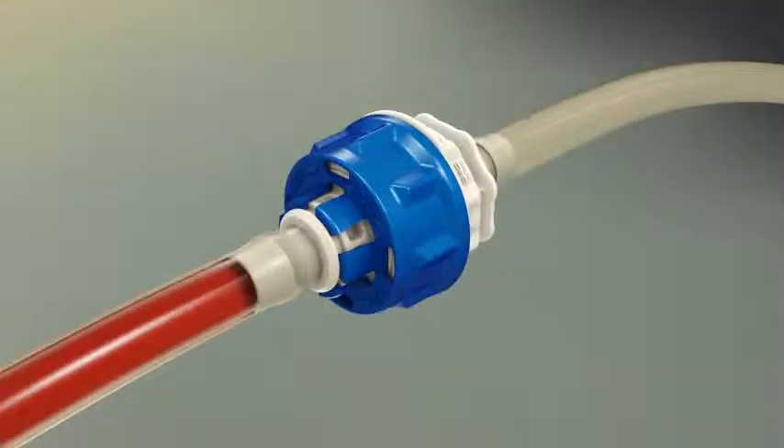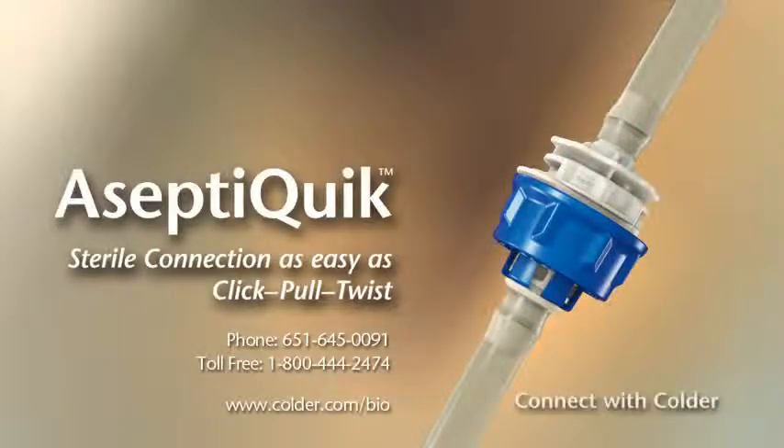You are now ready for sterile fluid transfer. Please contact your Colder Products representative for additional information on the benefits of AseptiQuik's Click Pull Twist technology.